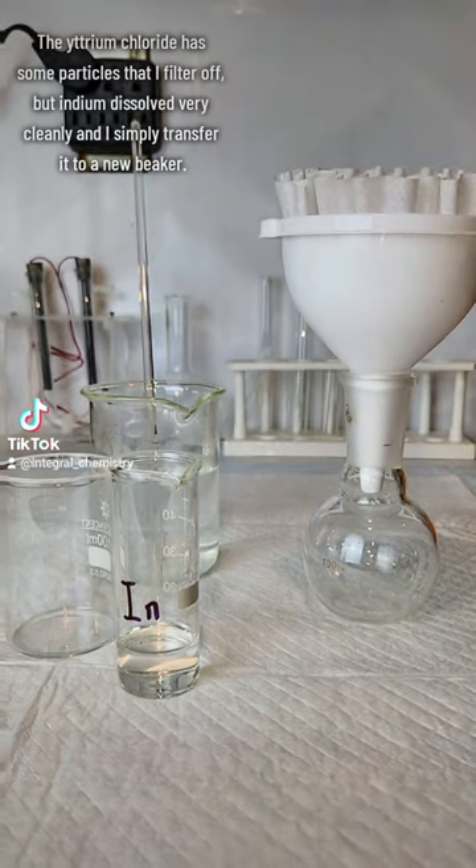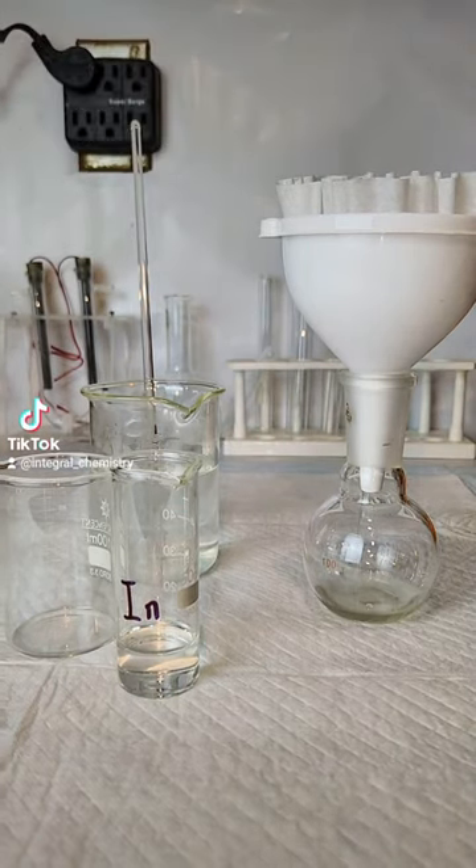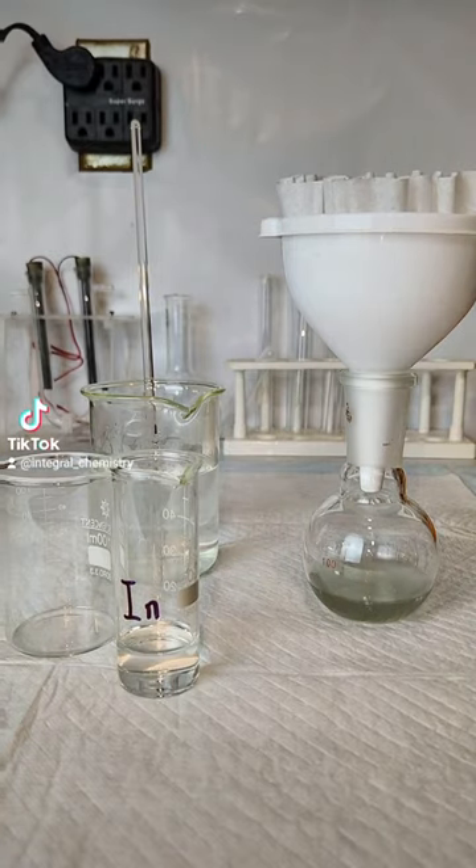Once they both finally dissolve, the yttrium chloride has some particles in it that I filter off, while the indium chloride is completely clear and I simply transfer it to a new beaker.